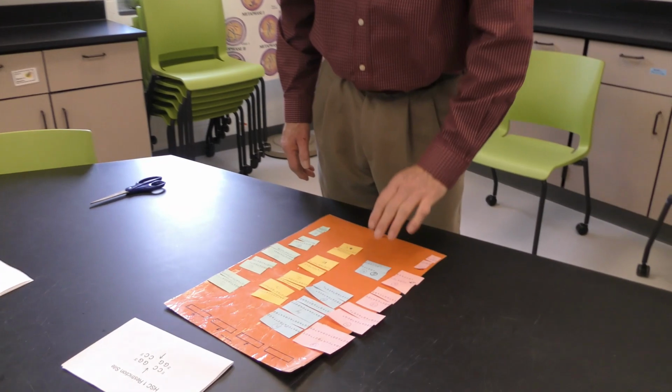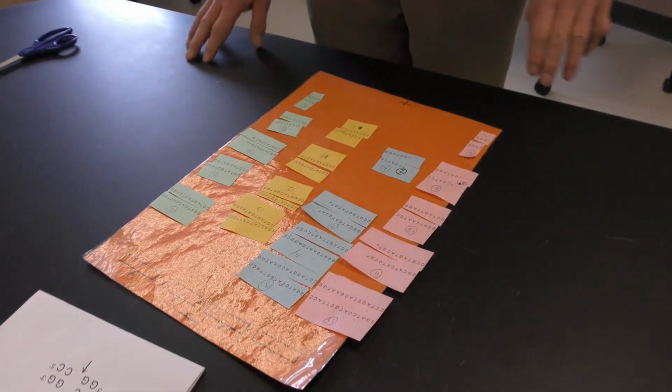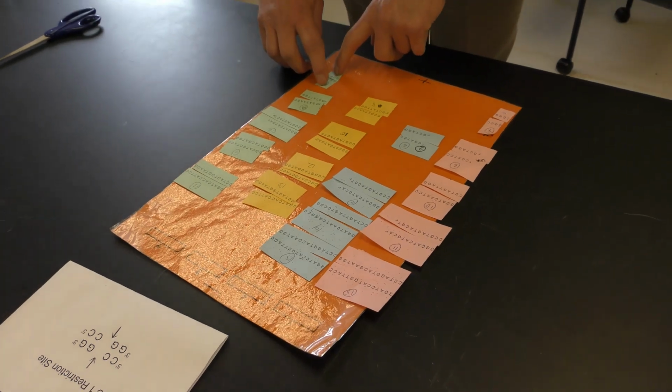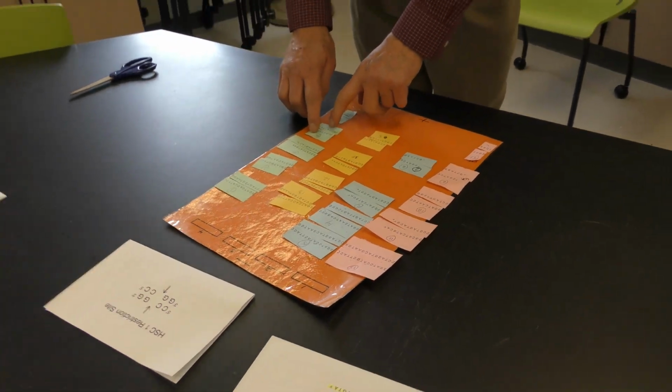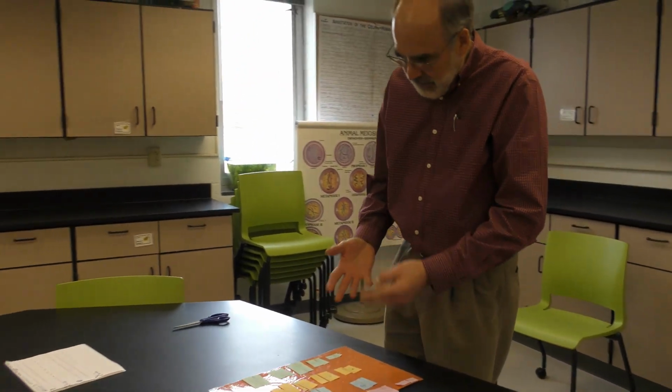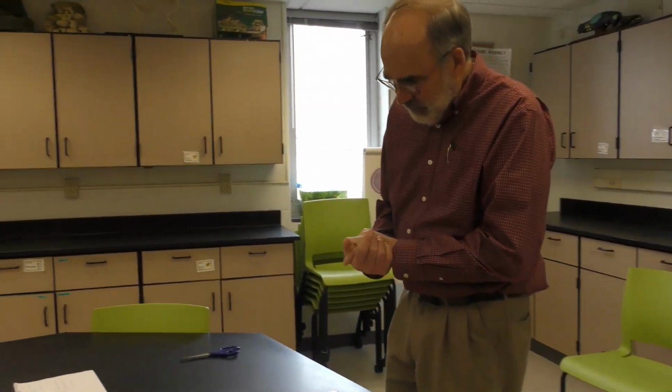Okay, now we went ahead and created single-stranded fragments from all those double-stranded fragments by using the scissors, and this is what they look like. And they're arranged in the same position on the gel as the original. Okay, so basically what happens now, after you create these single-stranded fragments, you would blot them over to a membrane and then stain them.